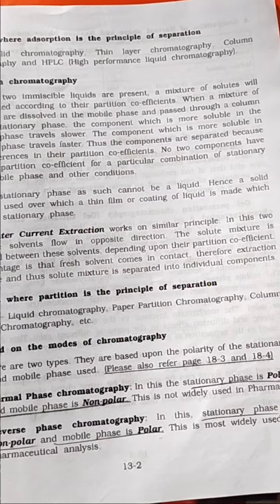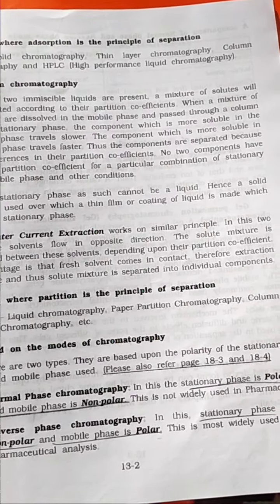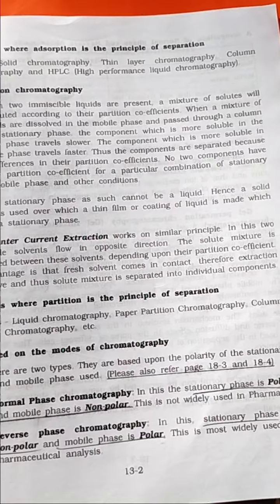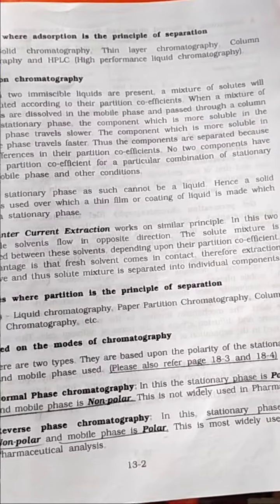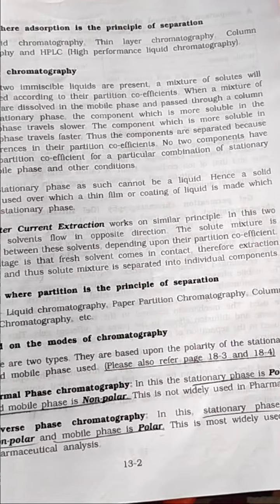The component which is more soluble in the stationary phase travels slower, compared to components more soluble in the mobile phase, which travel faster. So the compounds are separated by their partition coefficient. Here we can observe the difference.